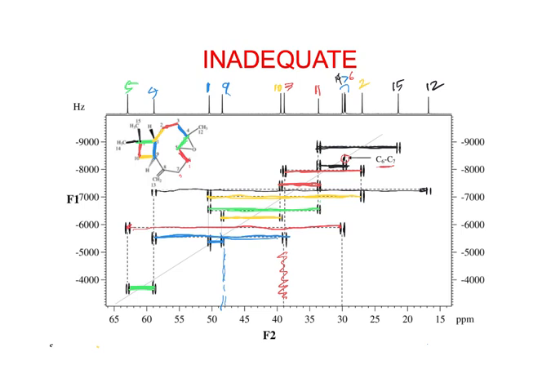So I could do this. This would be in blue. 6 to 7 is going to here. And then 7, one of those has to, maybe I have it blocked. That's it right here. There. From 7, we're going to go down to here, and this was 7 goes to 8. Right, that came out to the other part. So in fact, with this spectrum, because this is one entire spin system, we could just walk our way all the way around this.